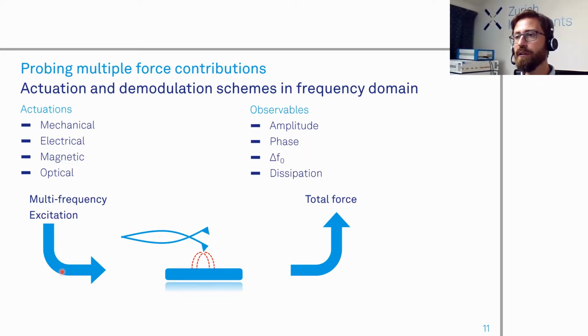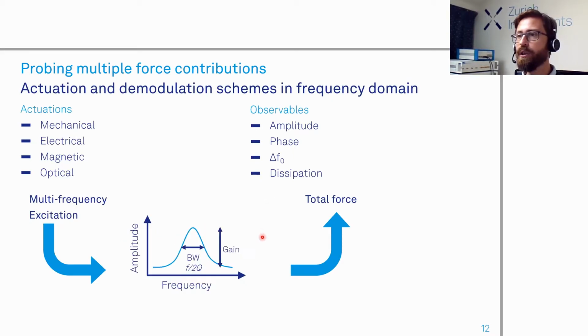And all this interaction is then going to be sensed by the tip-sample force field. And that will give rise to a rather complex tip trajectory in the time domain, and complex frequency mixing and higher harmonic generation in the frequency domain. But at the end of the day, you only get the output from your photodetector, and that corresponds to a total force. And you are typically left with just a few observables for all this complex physics, and which is assimilated as a resonator.